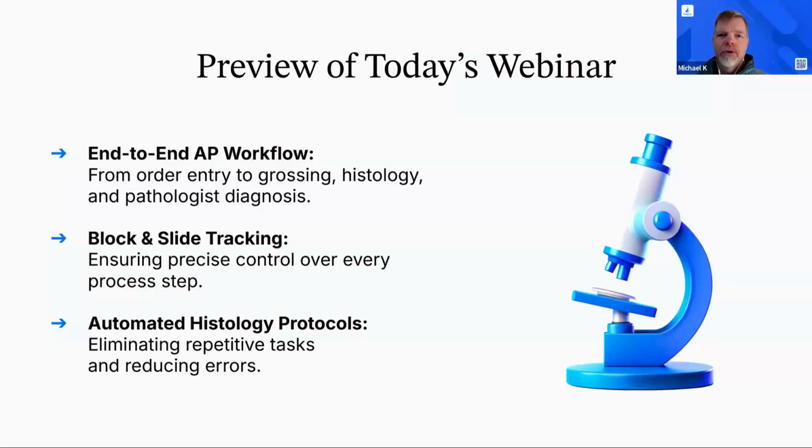Quick little preview of what we are going to show you before we go back to Olga to set the stage for what's to come. End-to-end AP workflow, block and slide tracking, automated histology protocols. Allison's going to show us quite a bit of the software. Of course, we like to say we have the most comprehensive and flexible laboratory informatics platform out there.